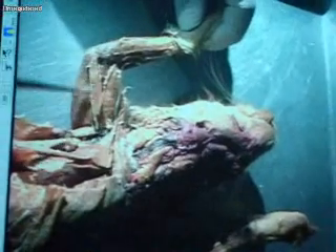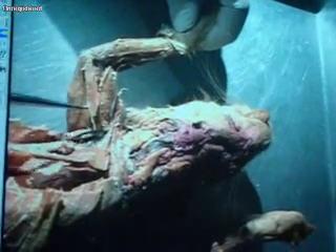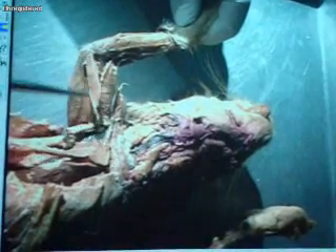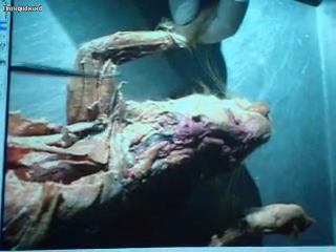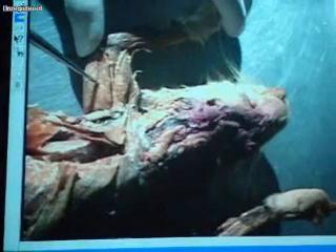Looking at the ventral view of the arm, we have epitrochlearis — this little skinny muscle overlying the ventral view of the arm. And then underneath epitrochlearis, this big muscle here is the lateral head of the triceps brachii.